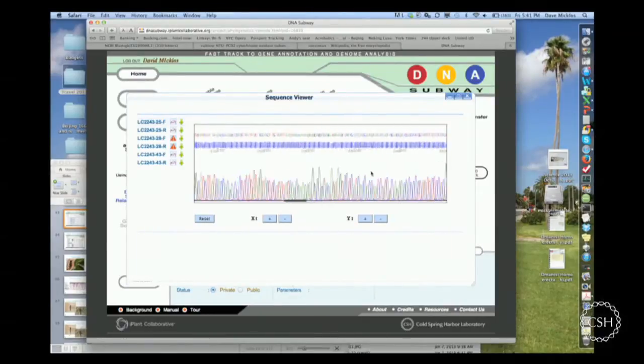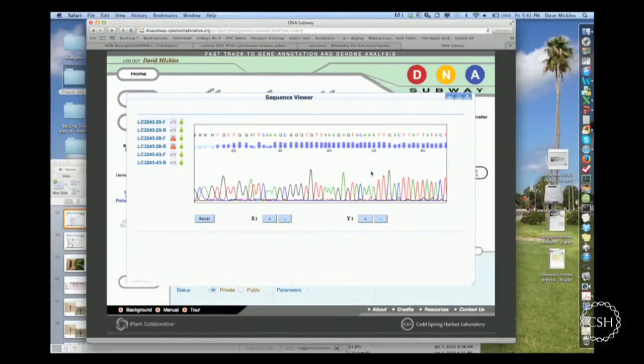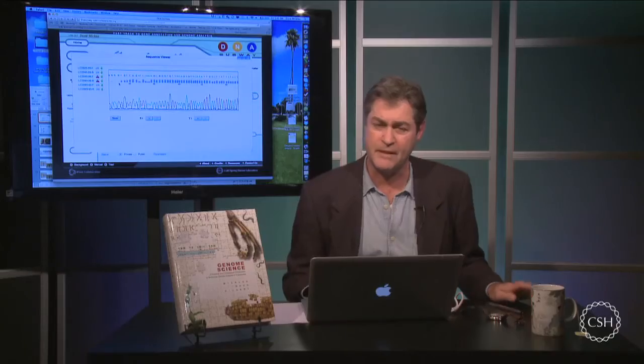Final thing I want to show you about this electropherogram viewer is something about the quality score. It's quite important. Quality scores range from 10 to 50. The first digit of the quality score, for example, the 1 of 10, means an exponent to the base 10.